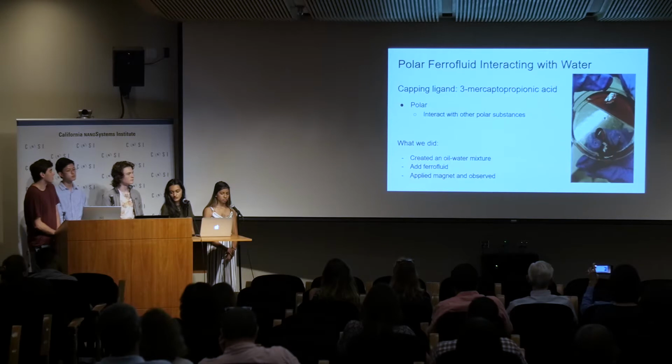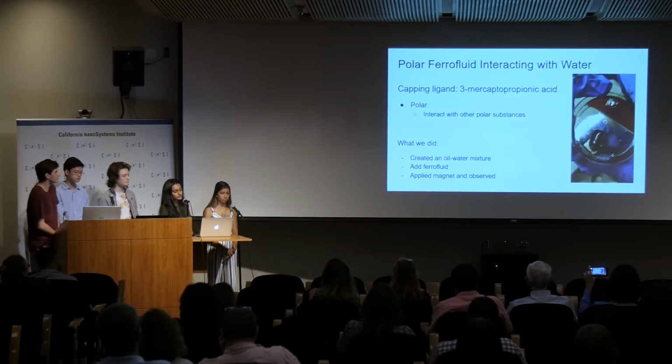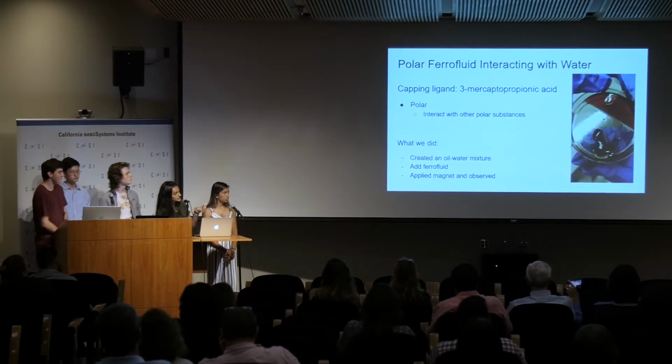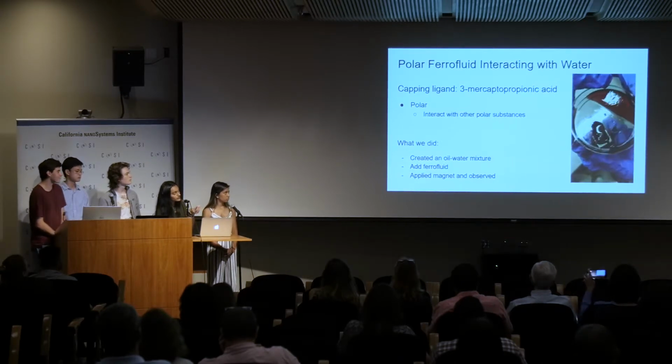And we basically used our 3-mercaptopropionic acid, which was our polar ligand. And then we placed the magnet under the petri dish. And as you can see in the image, it's pulling the water along with it and the oil is left behind.